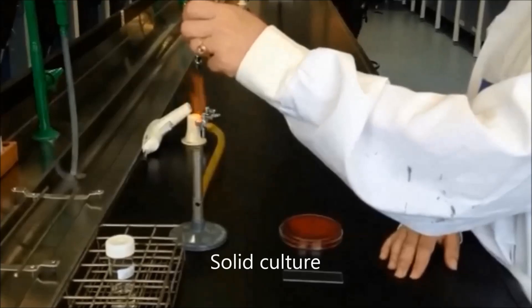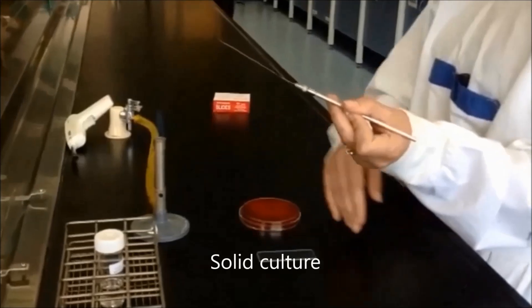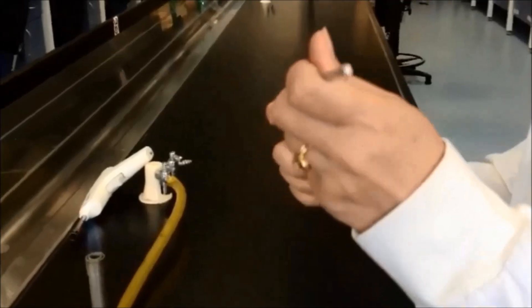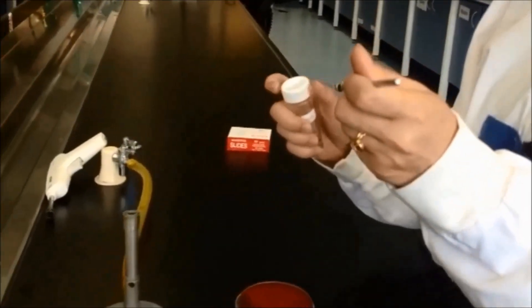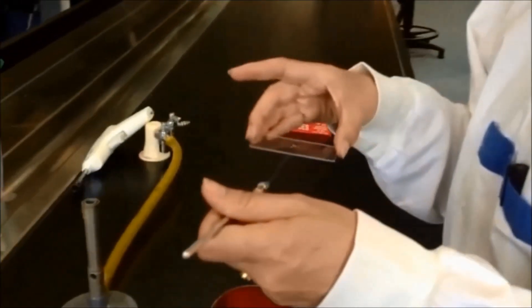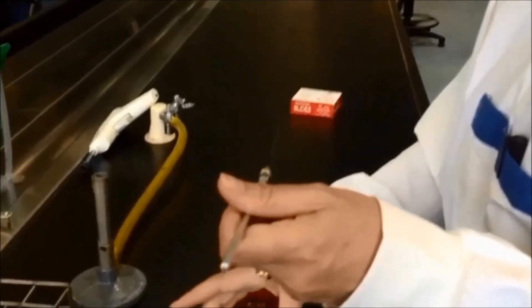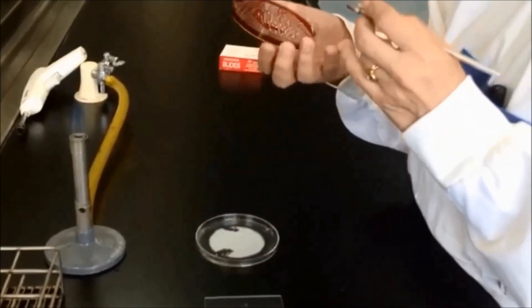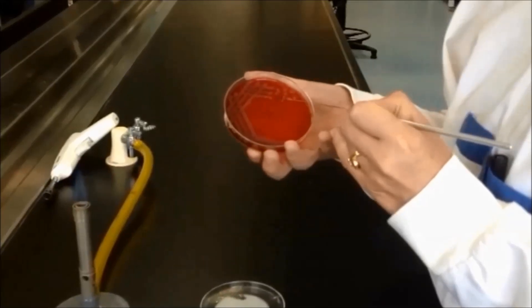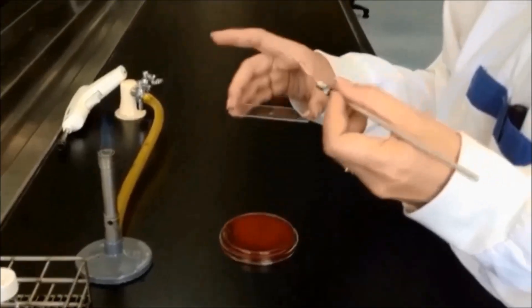To prepare a smear of a solid culture, for example from an agar plate, start by flaming an inoculation loop and waiting for it to cool. Place a loopful of sterile water onto the center of a clean slide. Transfer a small amount of an isolated colony into the drop of water. Emulsify well and then spread thinly across the surface of the slide.